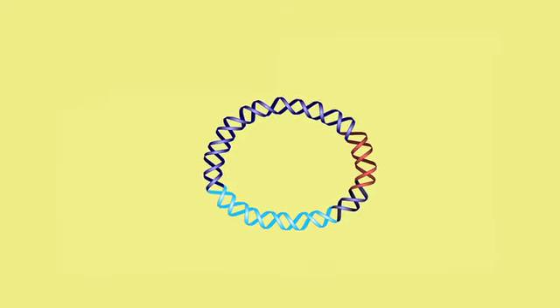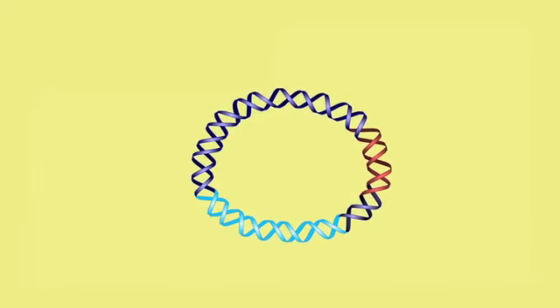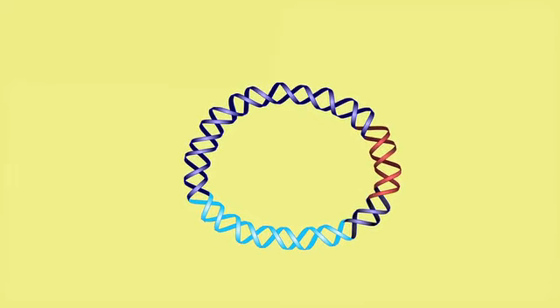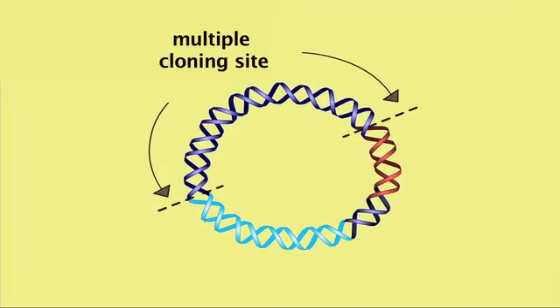I take a sample of some plasmid and I add it to the first tube. Plasmids were also originally found in bacteria, and are small replicating circles of DNA that have been engineered to contain a number of different restriction sites inside what is called a multiple cloning site.